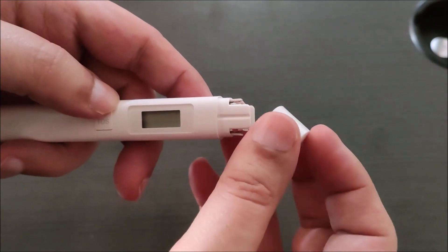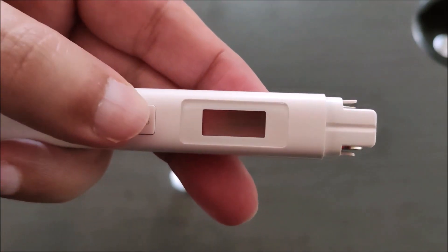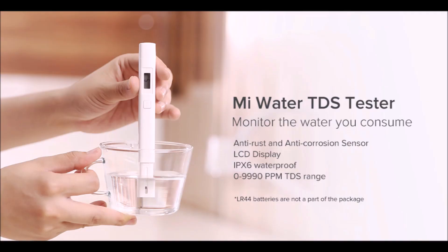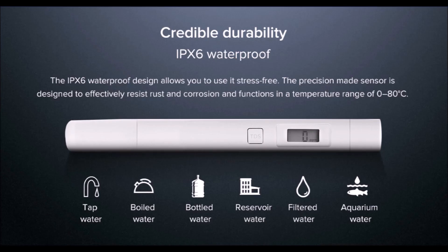The device is now ready to use and the reading shows 0. The Mi Water TDS pen has an LCD display. It is IPX6 certified, which makes it waterproof. It can measure a range of 0 to 9990 ppm — ppm stands for particles per million. The device can operate in a temperature range of 0 to 80 degrees Celsius.